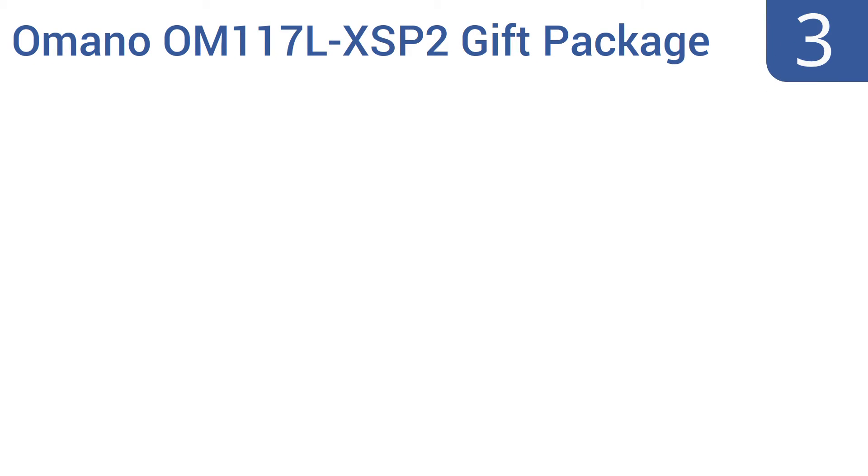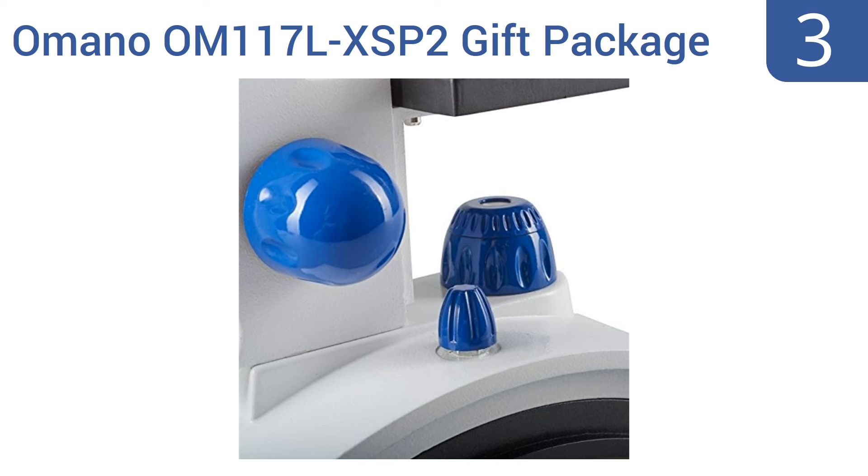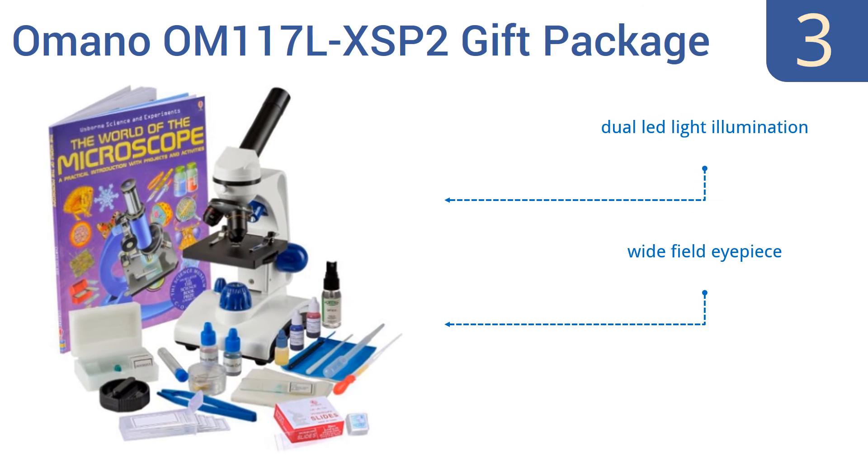Halfway up our list at number three, the Amano OM117 LXSP2 gift package comes with everything a young scientist needs to start conducting serious research, including slides, dyes, droppers, and an instructional book filled with activities. It's an award-winning microscope and pleasantly easy to use. It features dual LED light illumination and a wide-field eyepiece, and is powered by three triple-A batteries.